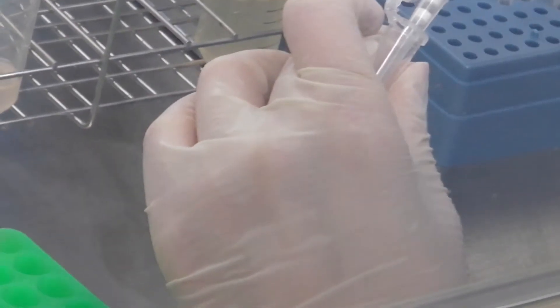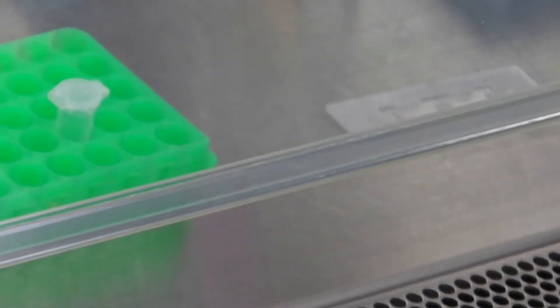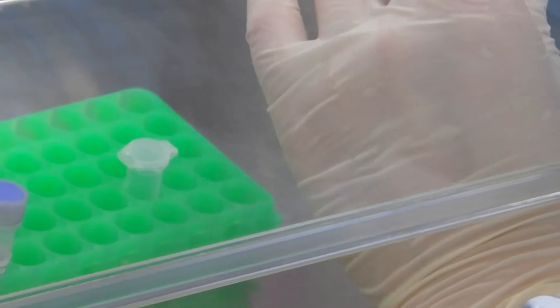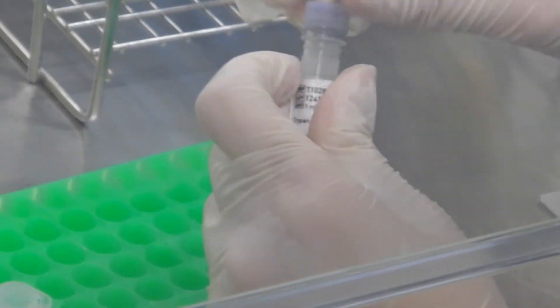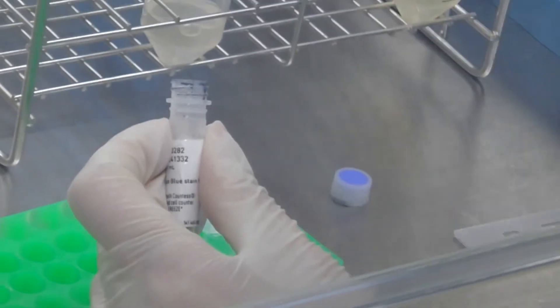10 microliters of cell suspension sample is collected from the mononuclear cell suspension and mixed with an equal volume of 0.4% trypan blue solution. The cell density of the sample is counted with a cell counter.